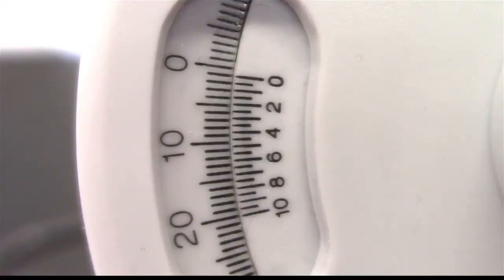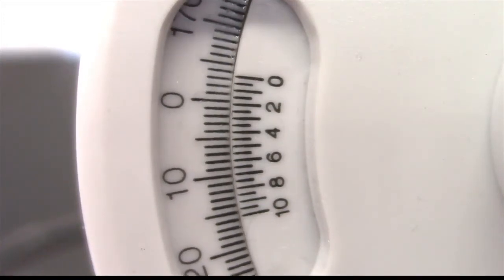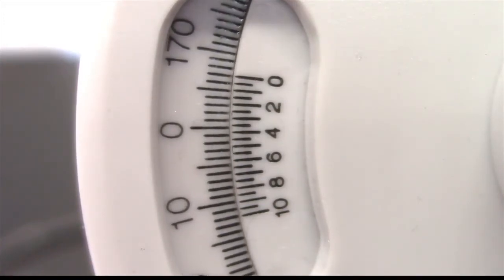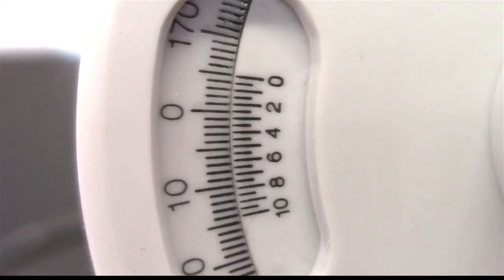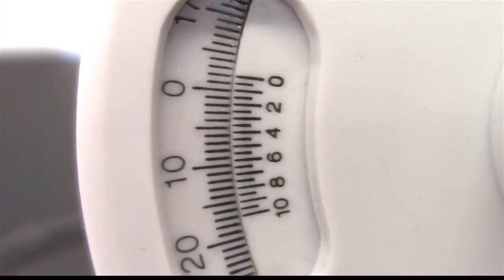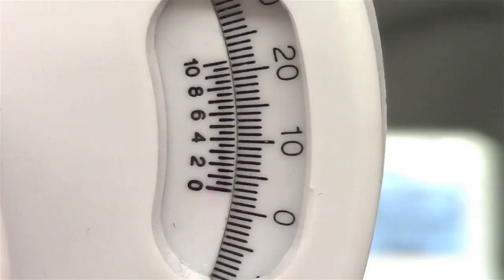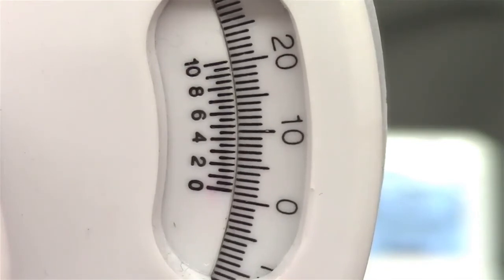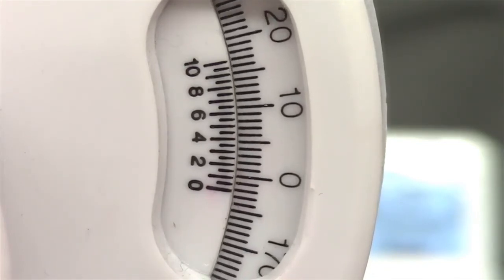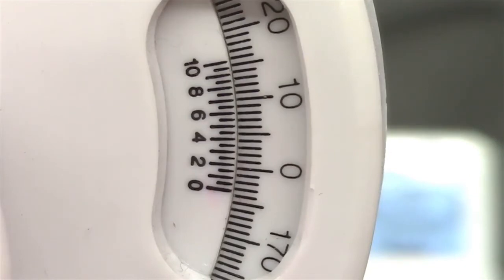If you take your reading on the left side of the machine and the zero on the inner scale is above the zero on the outer scale, this means you have a sugar that has a negative degree of rotation. If you take your reading on the right side of the machine and the zero on the inner scale is below the zero on the outer scale, this also means that you have a sugar that has a negative degree of rotation.